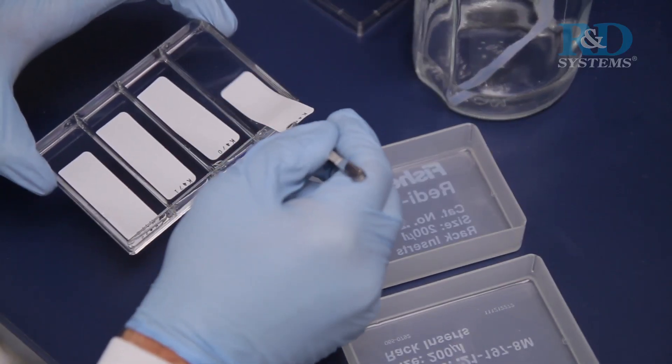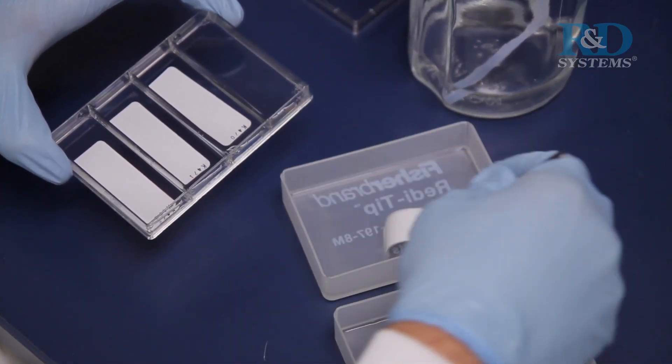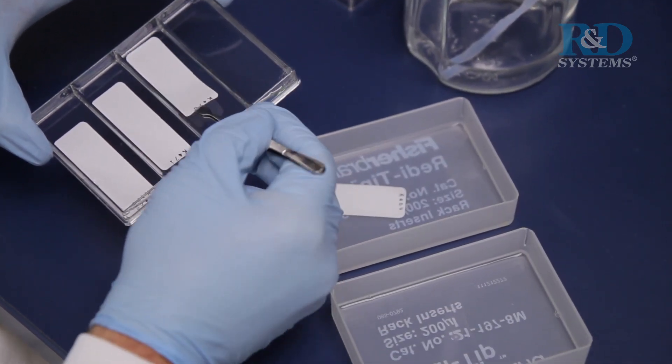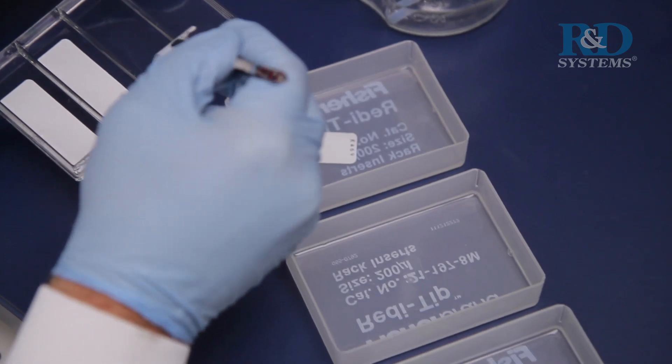Next, carefully remove each membrane from the 4-well multi-dish and place into individual plastic containers with 20 milliliters of 1x wash buffer.